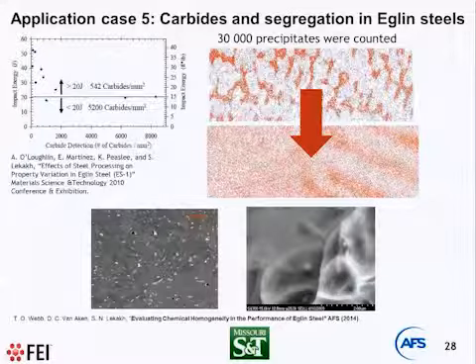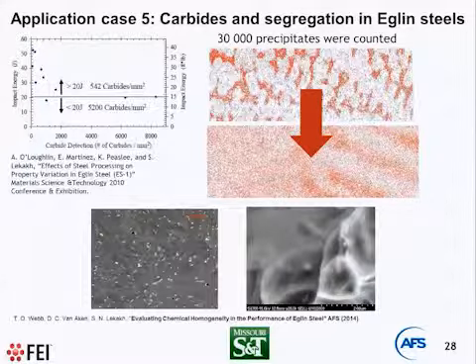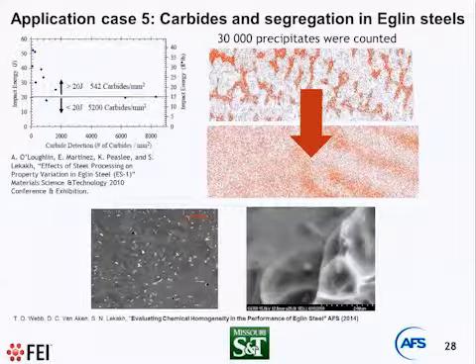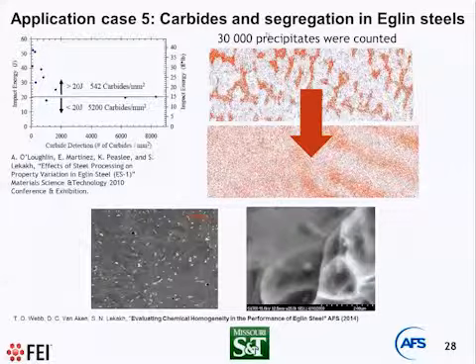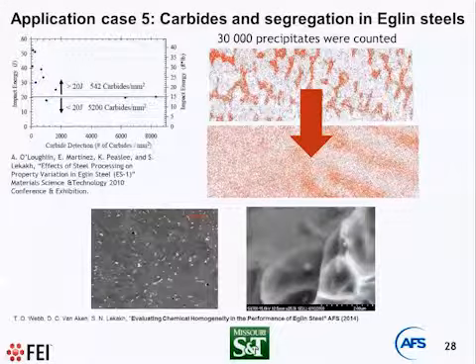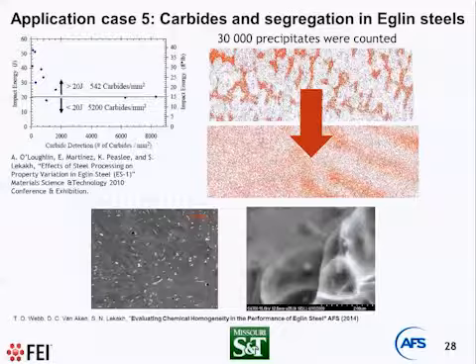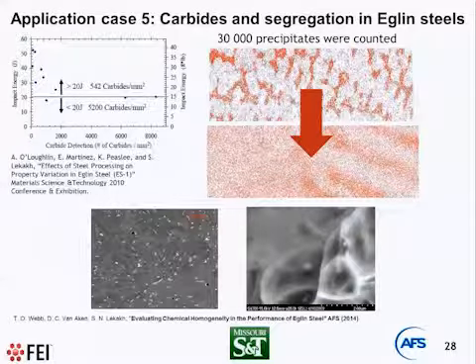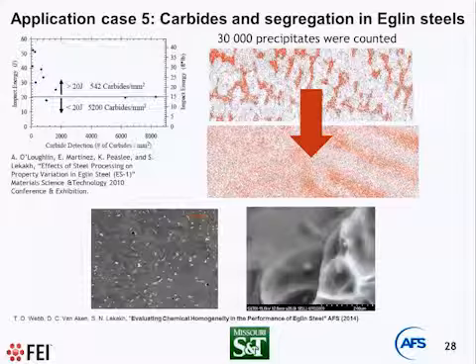Typically, automated inclusion analysis is used from 1 micron and above. We develop special technique allow us to detect 0.3 micron of carbide. But to see effect, because they're very small, we need to count 30,000 of inclusion. And when we count 30,000 inclusions, then we zoom out, we start to see what's going on. Okay, every one of these points was a detected carbide inclusion.